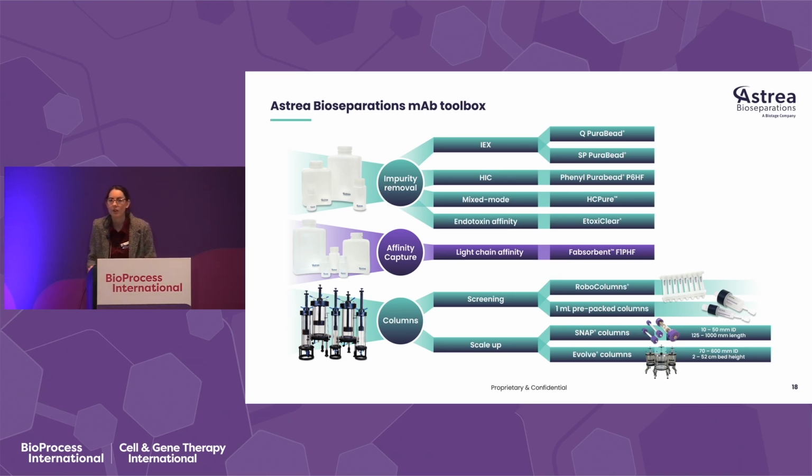So the question was, has there been any work to show the comparability between the mock MVM and live MVM? Yeah, Cygnus have a paper that shows comparability, and they have examples of the predicted log reduction values from their kits versus actual live MVM as well. Great. Thank you.